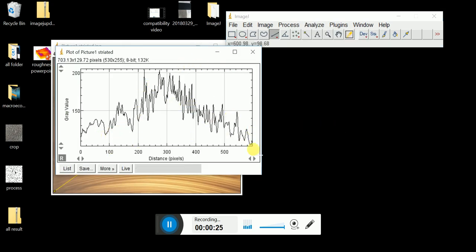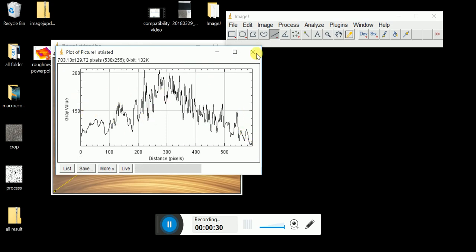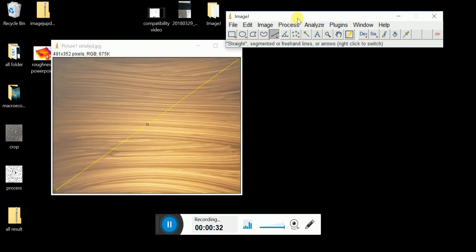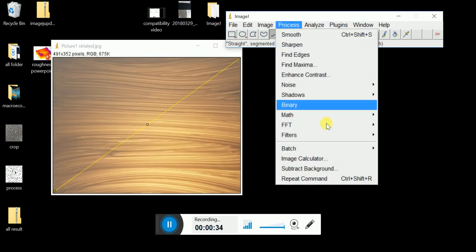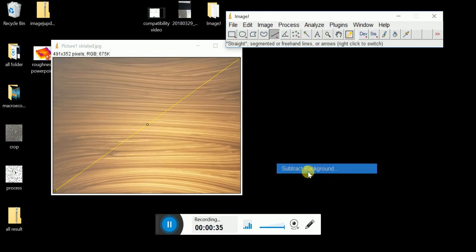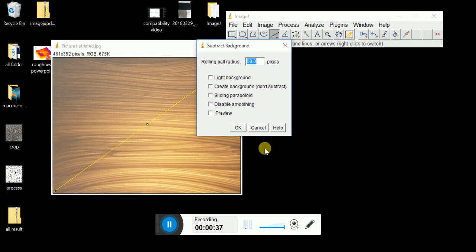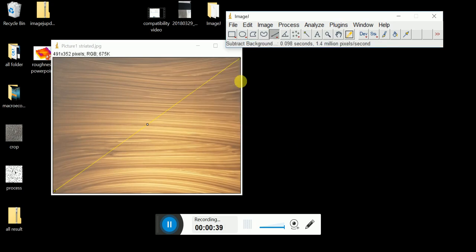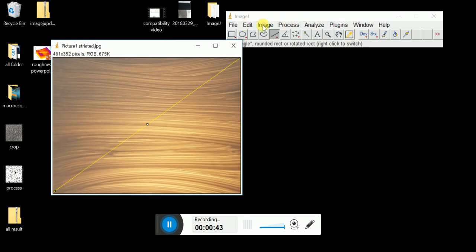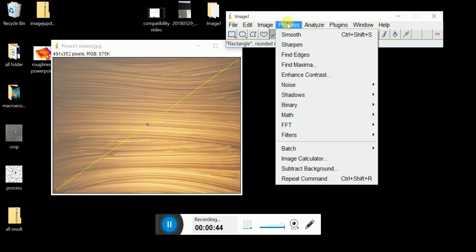So to analyze the roughness, you need it to be a straight line instead, a straighter profile. So what you need to do is click Process, Subtract Background. Normally I start with 50 or 20. You must click the picture, then click Subtract Background.